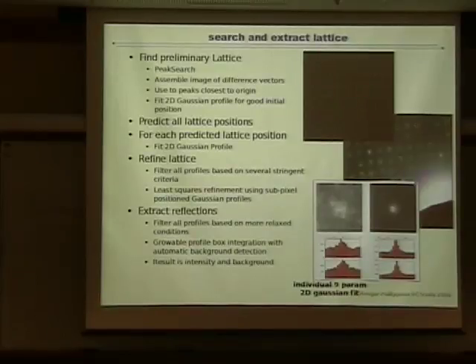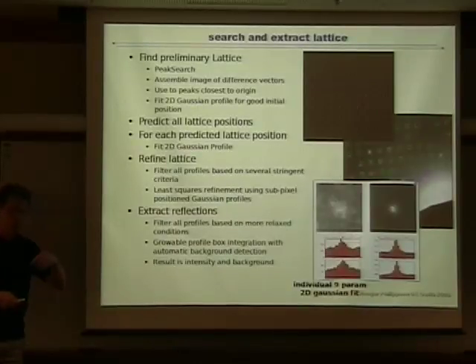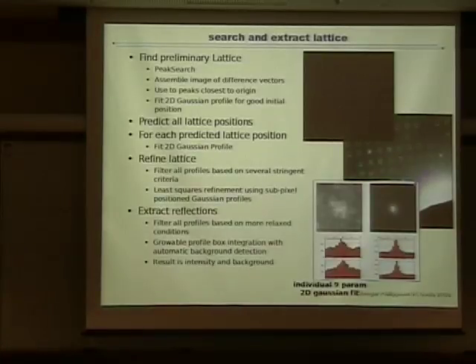You just take the two closest peaks. You do another peak search on that. You take the two closest peaks that follow a certain convention. So the angle has to be smaller than 90 degrees, I think, for reciprocal space in the convention, and the smallest vector is A, and the second largest is B, and stuff like that. And that's your first lattice estimation.